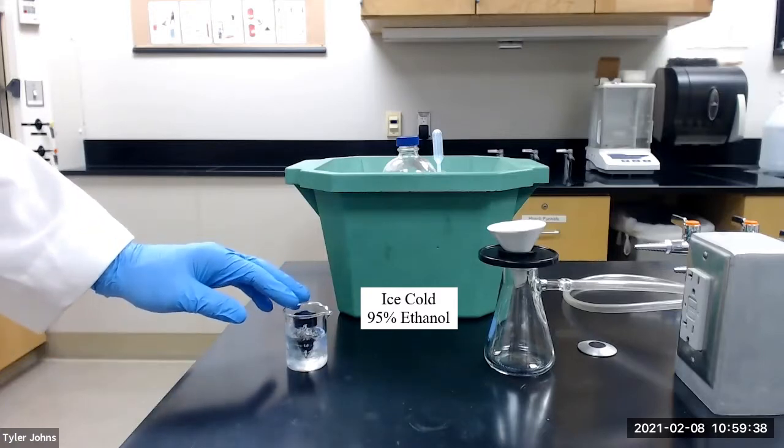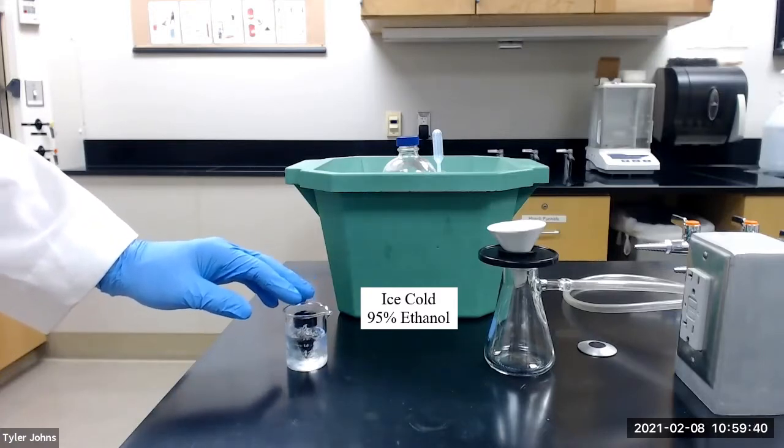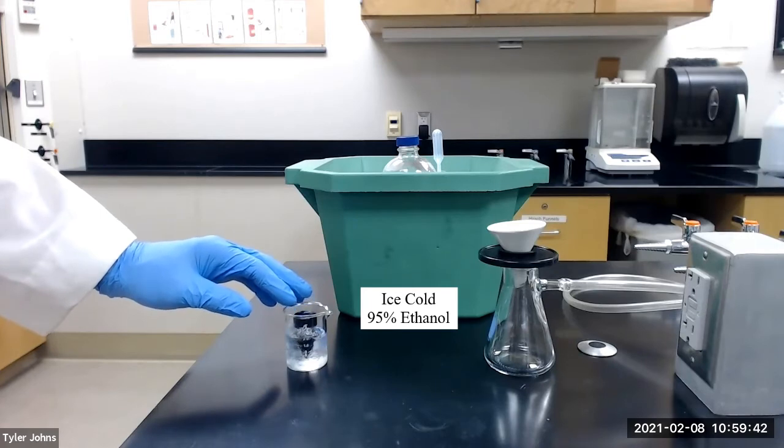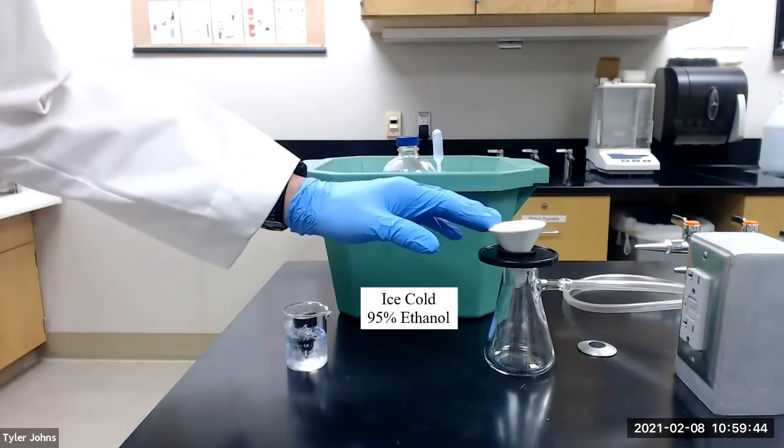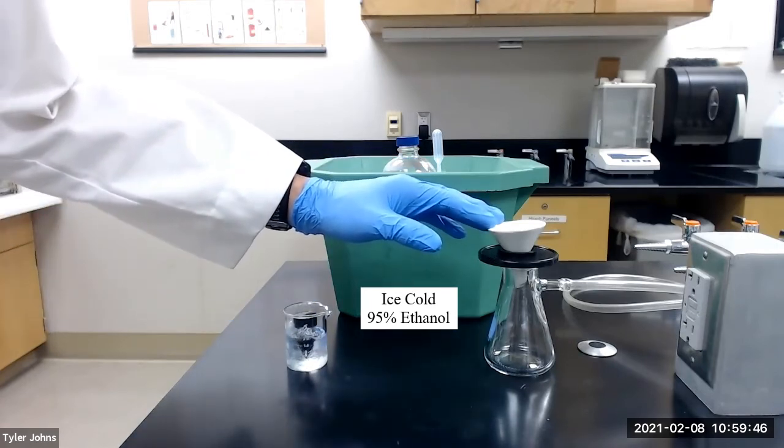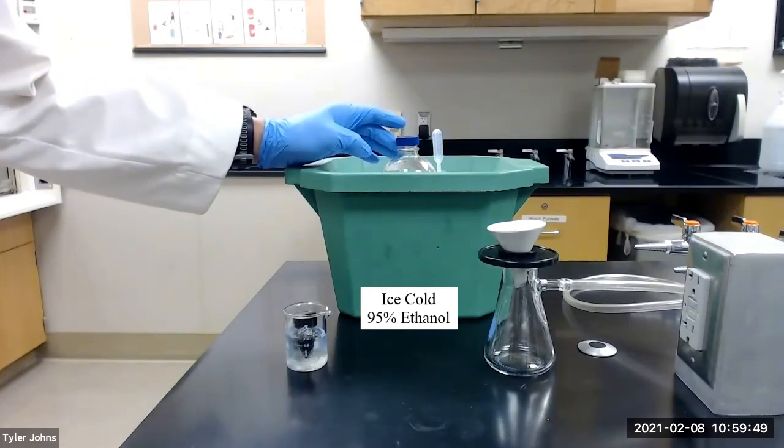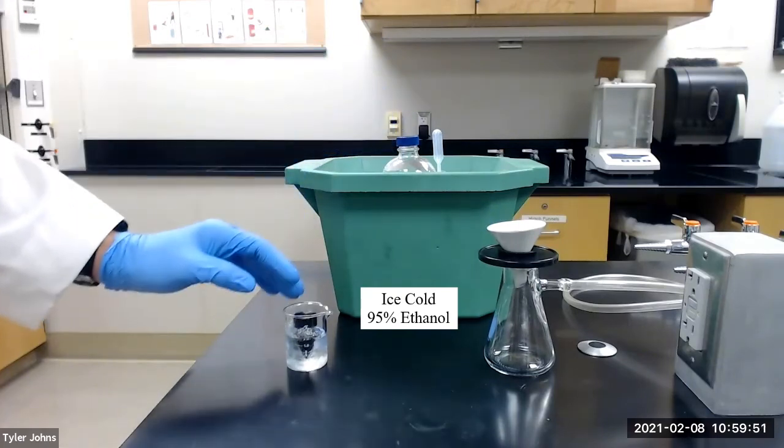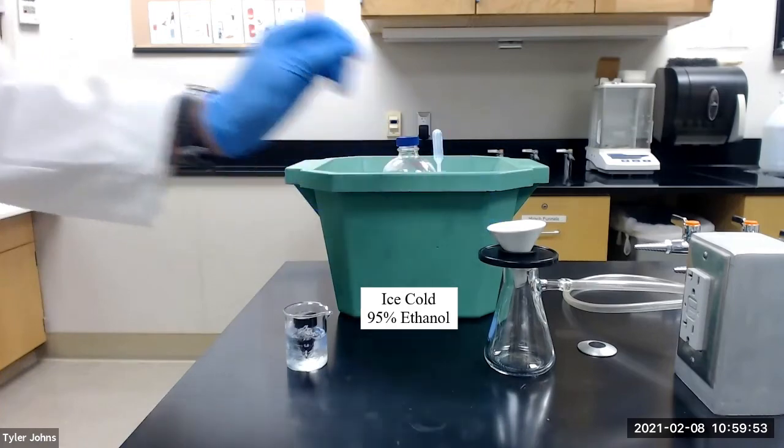After crystallization has completed, we will collect our tetraphenylcyclopentadienone crystals by vacuum filtration using a Hirsch funnel. We will use ice-cold 95% ethanol to aid in the transfer and the washing of our crystals.